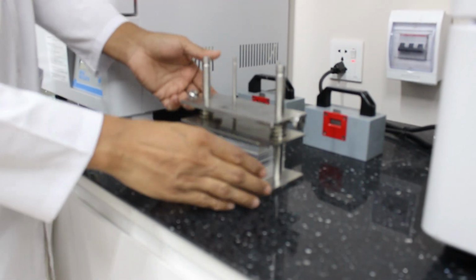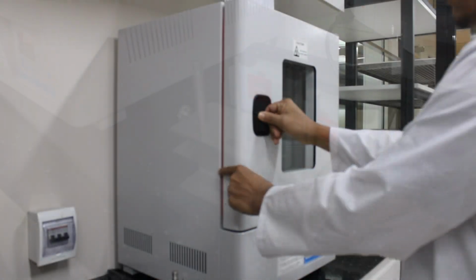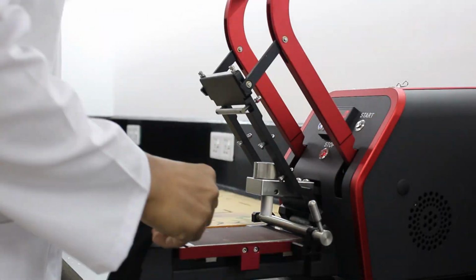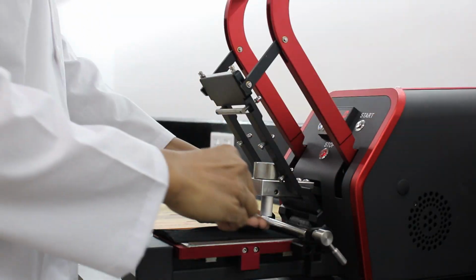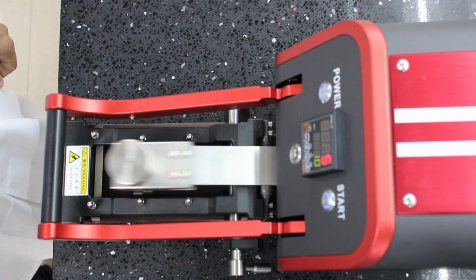for 48 hours. Color fastness to phenolic yellowing: discoloration of textile materials caused by the action of oxides of nitrogen and phenolic compounds, which lead to the production of a yellow color. Color fastness to crocking: the rub test determines color fastness under friction, both wet and dry, essential for evaluating fabric durability.